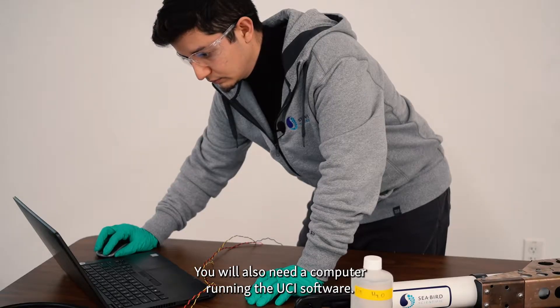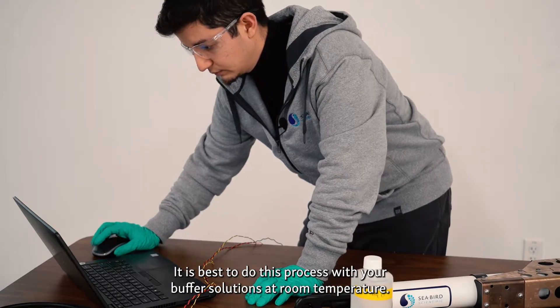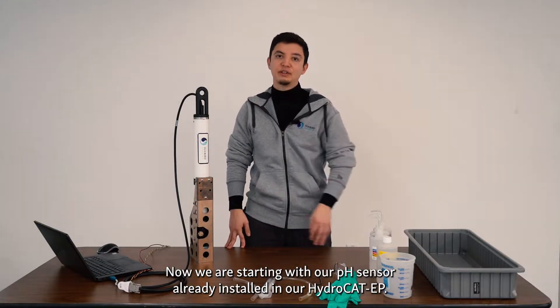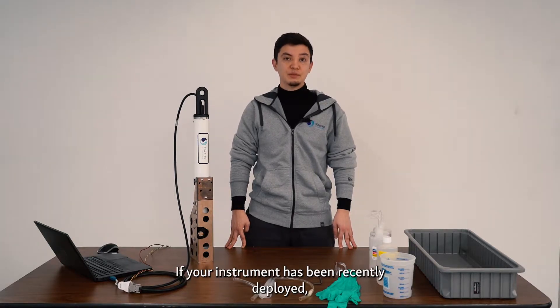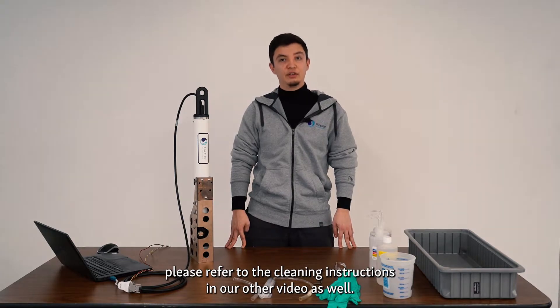You will also need a computer running the UCI software. It is best to do this process with your buffer solutions at room temperature. We are starting with our pH sensor already installed in our HydroCAD EP. For instructions on how to install, remove, and store your pH sensor, please refer to the instructions in our other video. If your instrument has been recently deployed, please refer to the cleaning instructions in our other video as well.